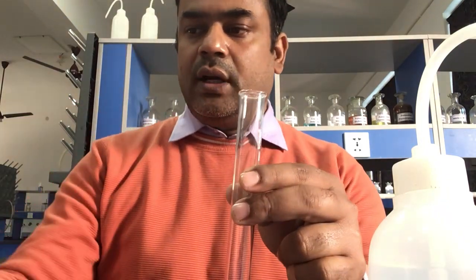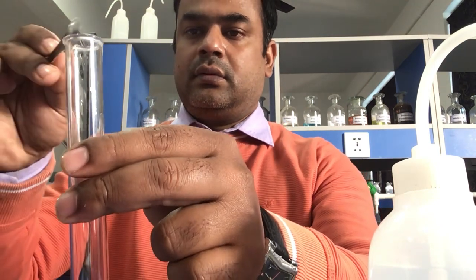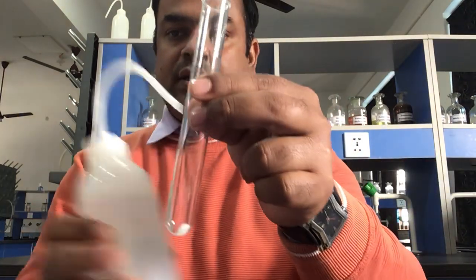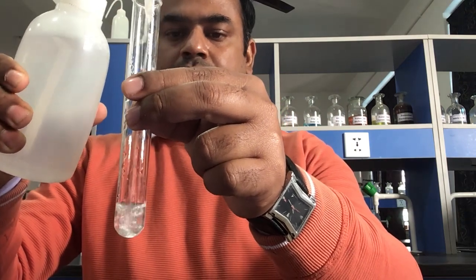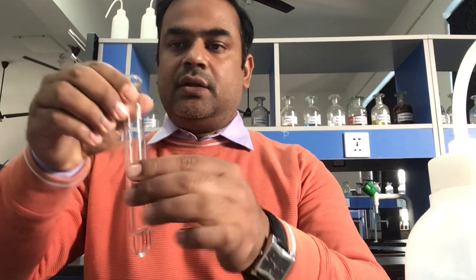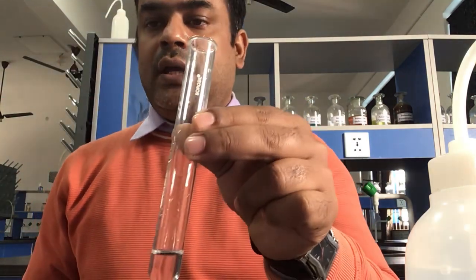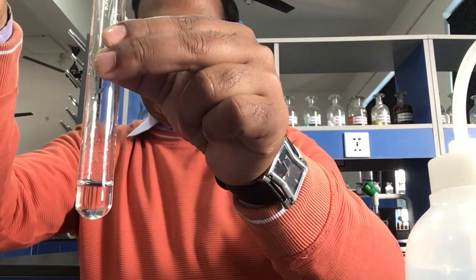Now another test tube is taken, and again a pinch of salt is added into it. Distilled water is added — you can see the salt here. Now an aqueous solution of AgNO₃ is added into the salt solution.